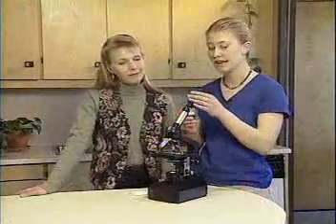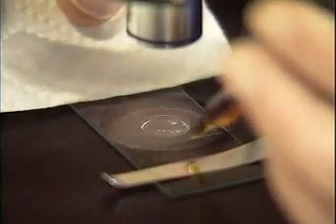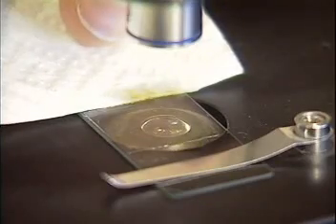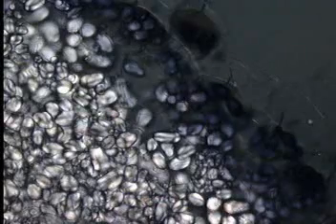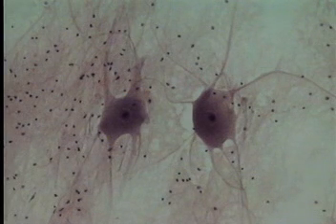A wood stain brings out the grain in this cabinet, and this dilute iodine will highlight cells of the potato. So instead of water, I'll add a drop of iodine. I see something. So the grains of starch in potato cells are highlighted by iodine. Some stains are used for plant cells, but others work better with animal cells, such as this nerve cell. The nucleus really stands out.